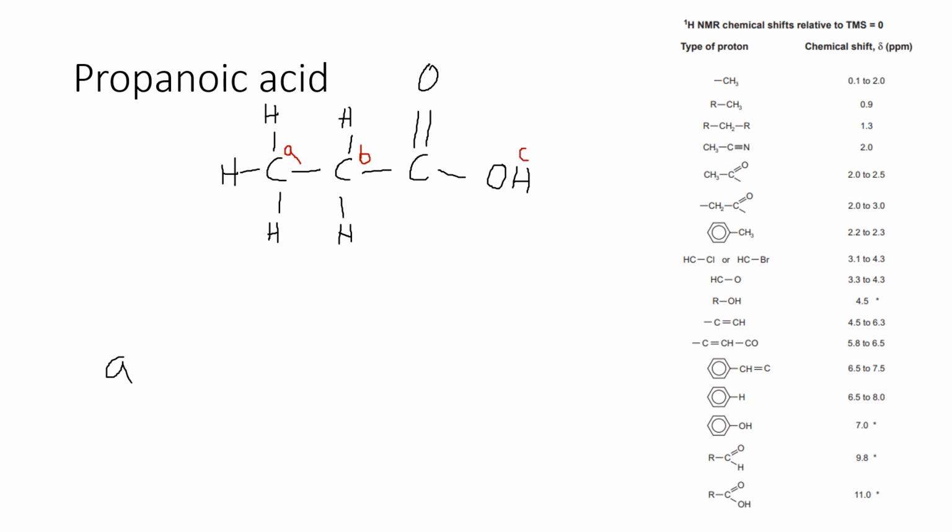So we'll make our little table again. As I've said before, this is perhaps the easier way of doing things. Here's the molecule. Let's work out what the spectrum would look like. It's more challenging to take the spectrum and work back to the structure, but I will look at that perhaps in a later video. But it's good to get the basics first.